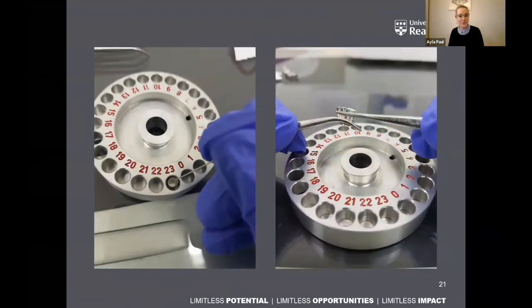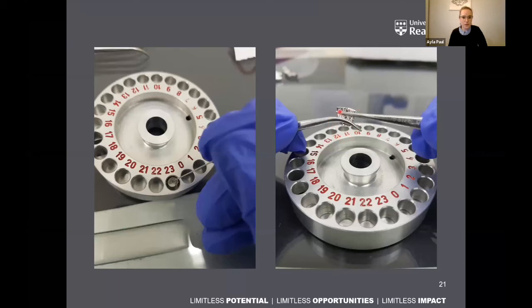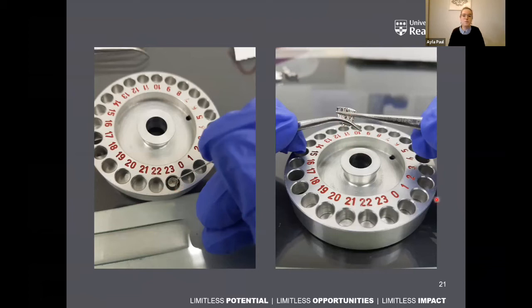In the lab, you can see in my hand a needle thinner than a paper clip. In the little hole is a tiny capsule — silver if measuring oxygen and hydrogen isotopes, or tin if measuring carbon and nitrogen. I use this needle to dip into the honey and lightly touch the little capsule, then weigh it to make sure I've got the right amount of honey before folding it up tightly to go into the mass spectrometer. The weight of each honey sample is only 0.2 milligrams — that's not even the end of a paper clip — so you can't make mistakes, as there's no scooping honey back out if you've added too much.